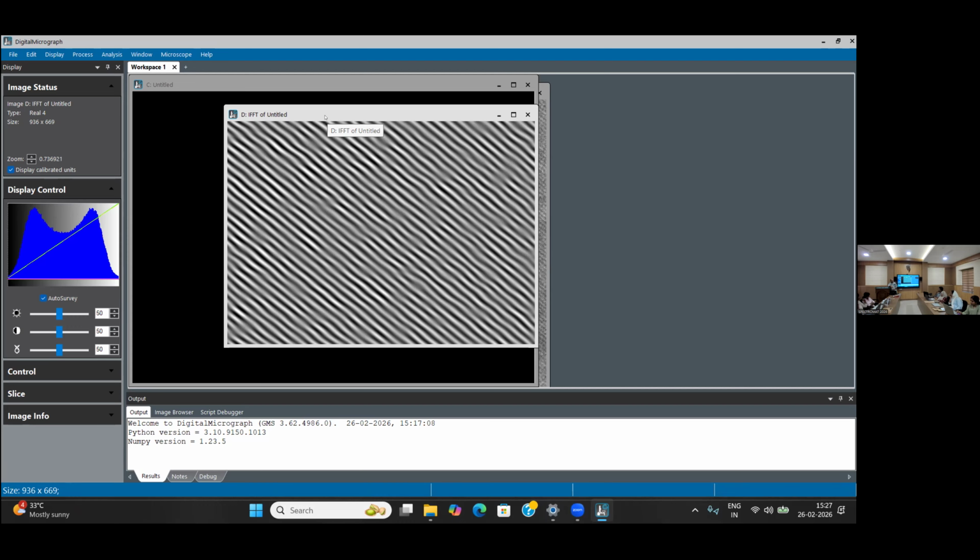Yes. Don't go directly to TEM after synthesis. First, you thoroughly check your sample. First, check with UV. If the peaks you got are in the exact position, then you can confirm there. And then the purification, like the pure sample will give better quality images. And if you have some images, then we will get some idea about the morphology and all.